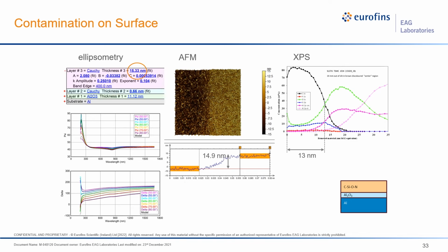For these very thin films, we always see discrepancies between the different techniques, and that often leads to lively discussions among the specialists. However, given the uncertainty in the determination of thickness for the various techniques, we feel that the agreement is satisfactory.